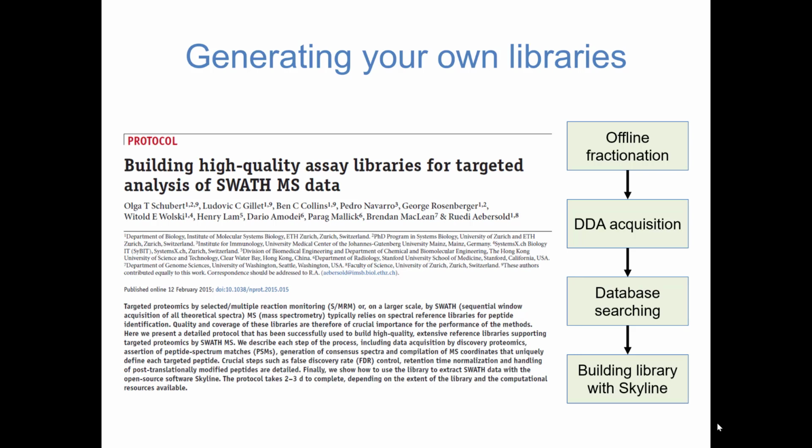I don't know if you can use multiple search engines, but it's not a necessity. The Skyline builder is a much more robust tool for doing this, so that might make your life a little bit easier too.